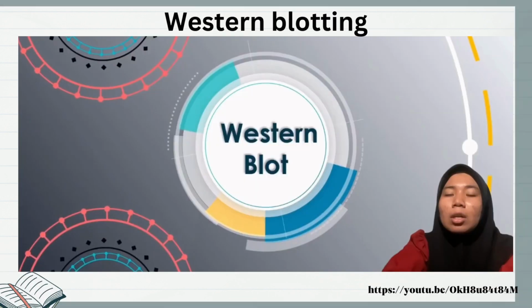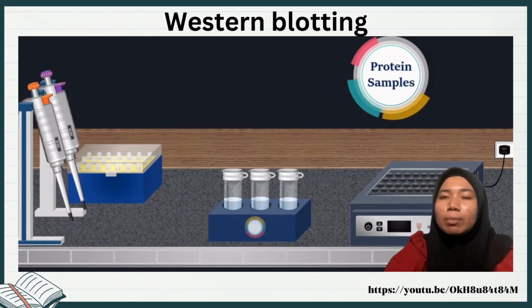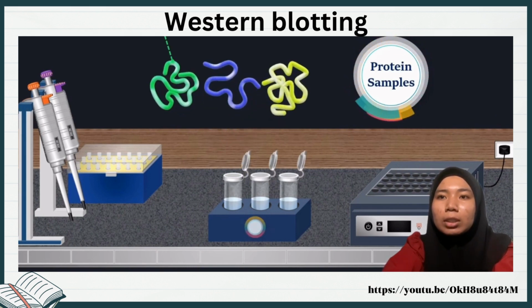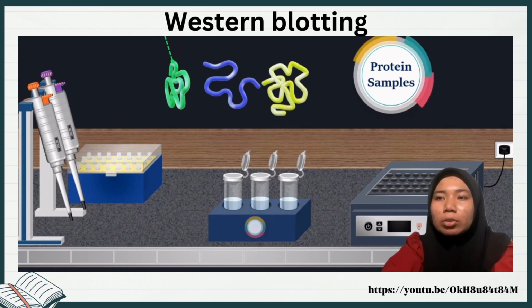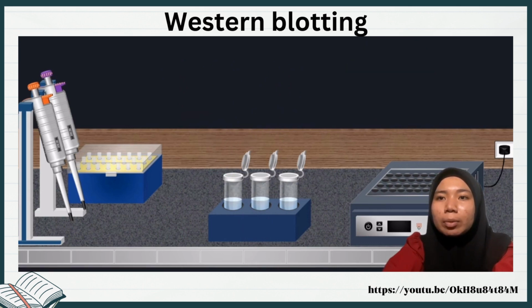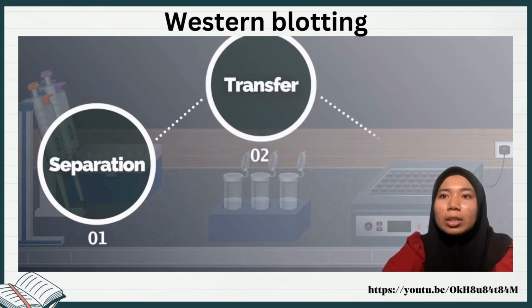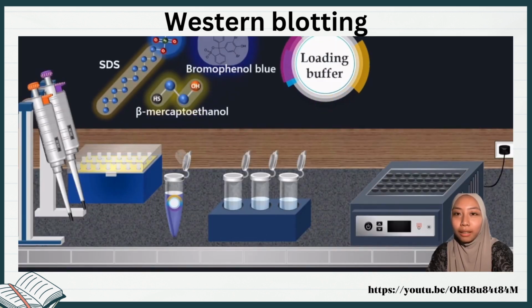Western blot procedure is typically a cell and molecular biology procedure widely used in protein analysis. Also known as immunoblotting, the method allows researchers to determine the presence, size, or quantity of a particular protein in a sample. The principle of Western blot is based on polyacrylamide gel electrophoresis and antibodies. Western blotting technique steps include sample preparation, gel electrophoresis, protein transfer, blocking, primary antibody incubation, secondary antibody incubation, protein detection, and analysis. There are 7 steps in Western blotting.